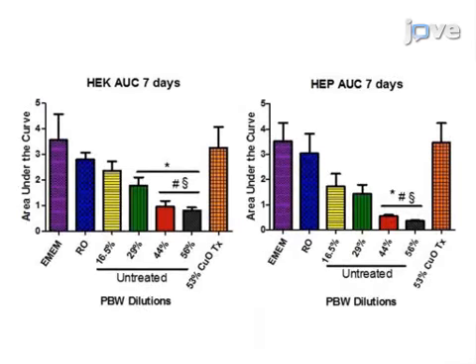Ultimately, the MTT assay demonstrates the removal of arsenic, selenium, vanadium, and uranium from production bleed water by cupric oxide nanoparticles is associated with increased viability of human kidney and liver cells. This is the first study to investigate the removal of specific contaminants using cupric oxide nanoparticles while assessing changes in cytotoxicity associated with the removal in a cell culture format.